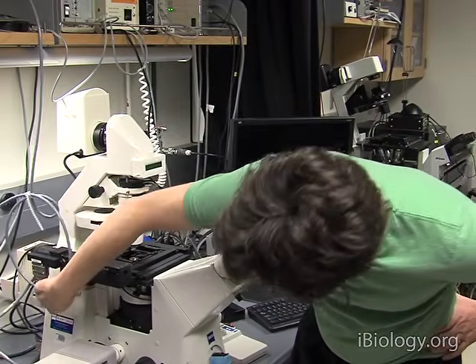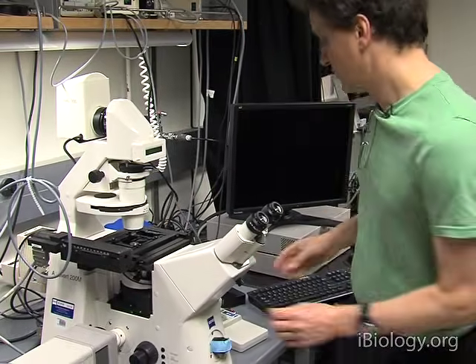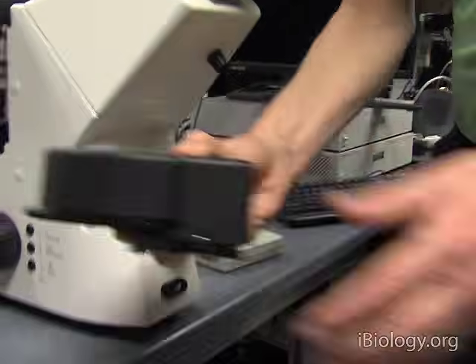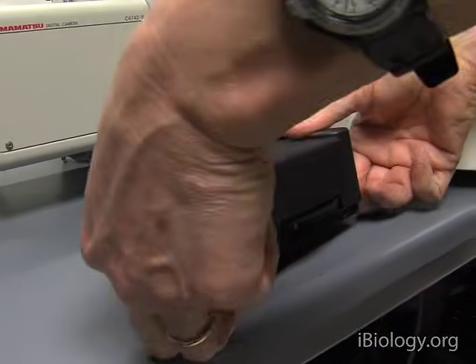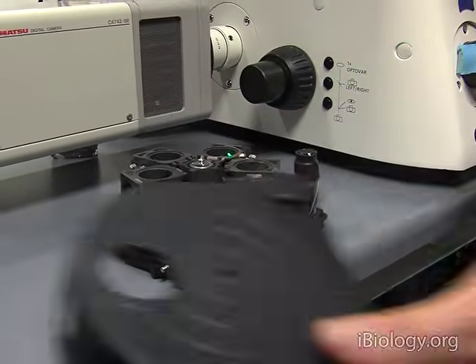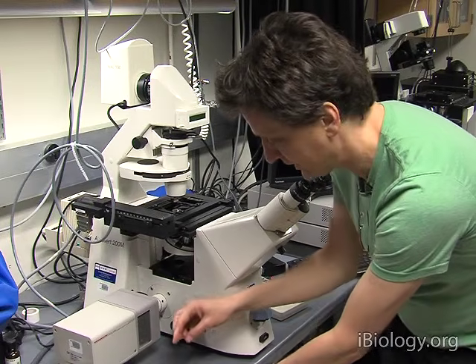That light then passes through the main body and then hits here the dichroic mirror. So, and I'll show you now how this works. So this is basically a carousel that you can take out. And this carousel, or turret, contains these same filter cubes that we have been looking at in the lecture.